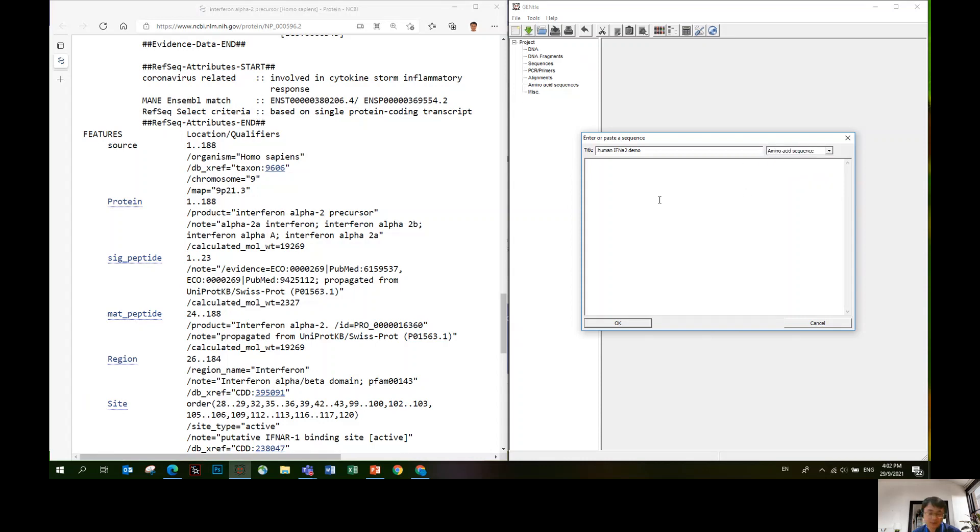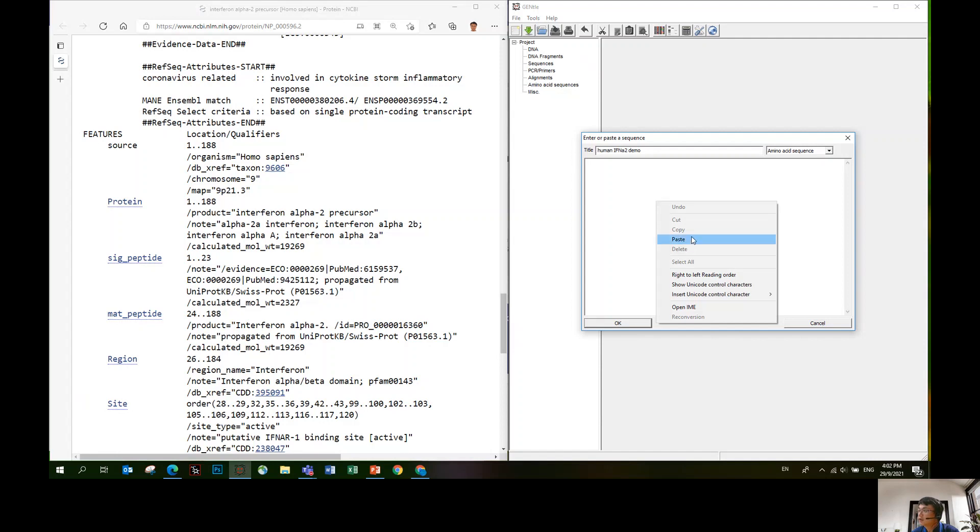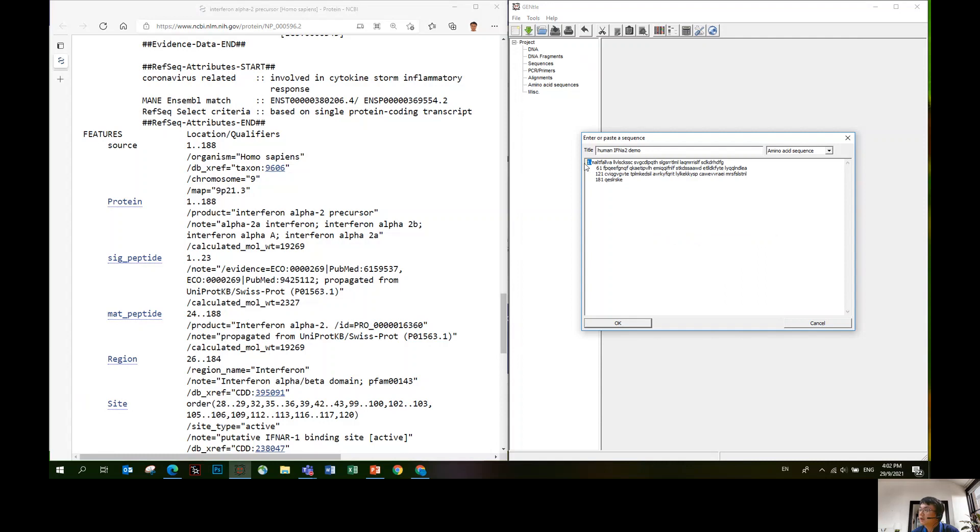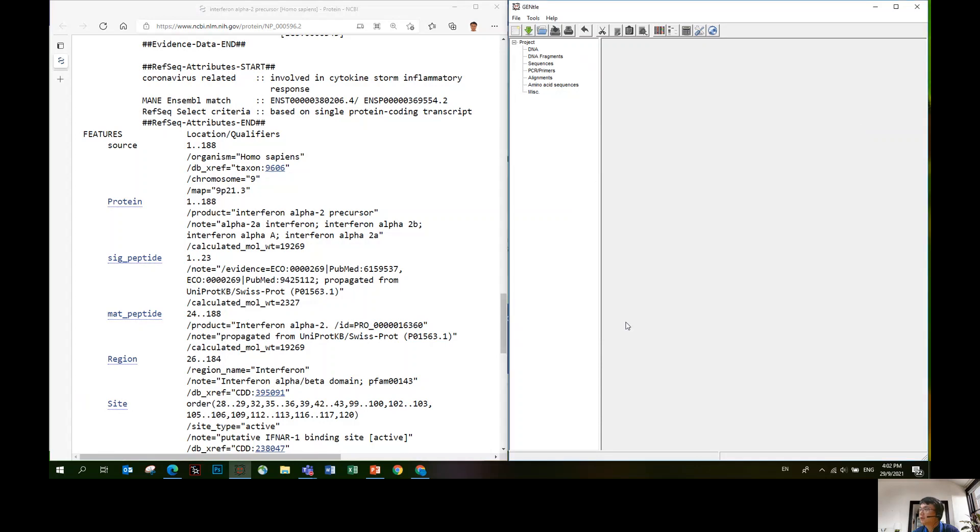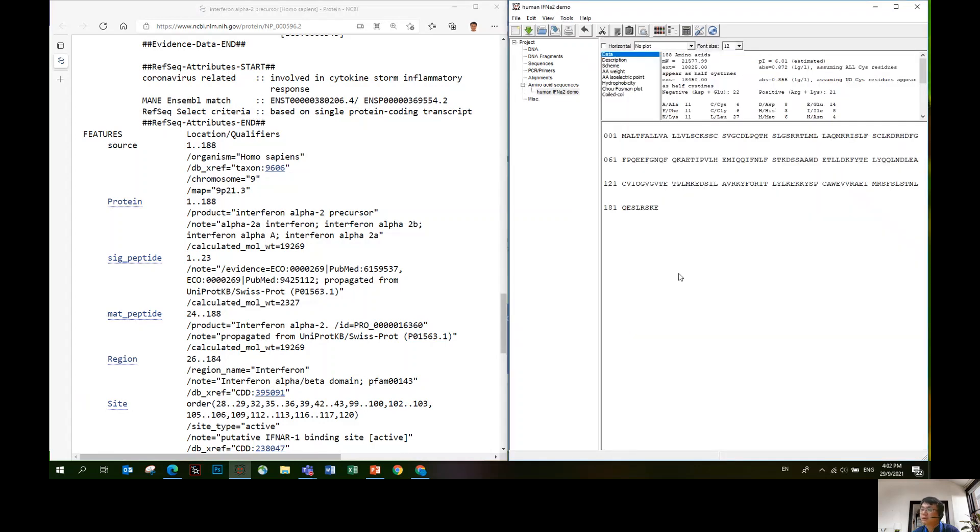Once you're done with the title and category, just click ctrl V or right click paste. Notice there are some numbers. It doesn't matter and there's some space between the alphabets. All this will be automatically filtered. Just click okay, then you have it.